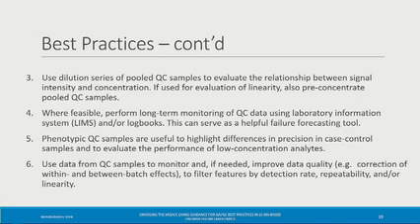Mm-hmm. But what we found in our lab to work, and don't quote me on this, is that instead of pre-concentrating or diluting the sample, we just change the injection volume. So we just inject 20, 15, 10, 5, and then it works somehow. But I don't know if it actually works in the same way.